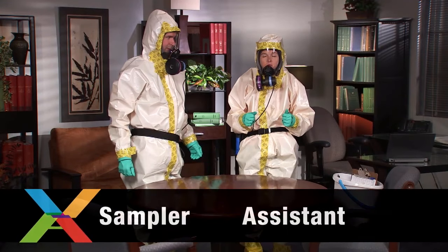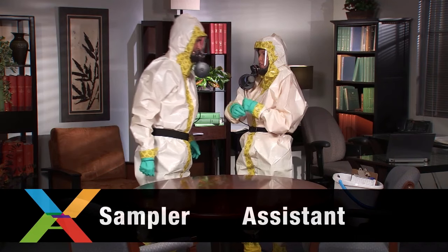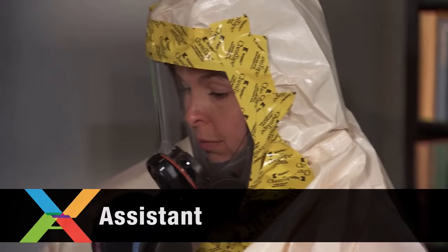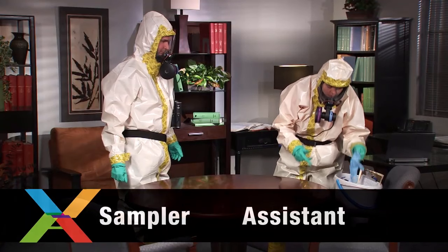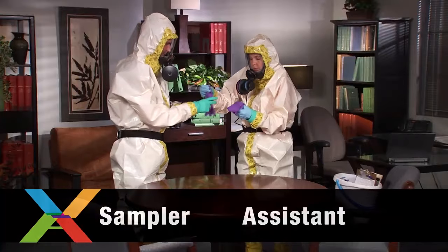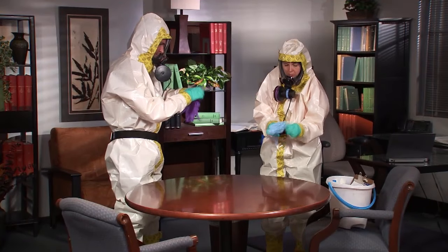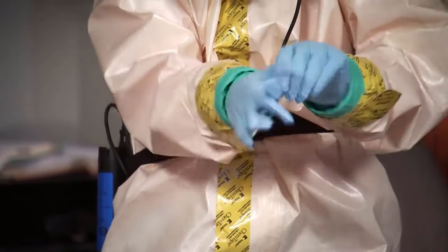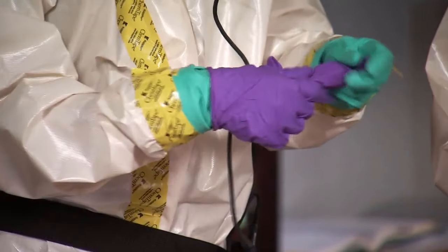Before you start, identify the sampler and the assistant. To minimize the potential for contamination, you should not change roles while collecting samples. The assistant will handle all the supplies, never touching contaminated surfaces. The sampler will only touch the supplies as the assistant hands them over. The sampler and the assistant start by putting on new, clean gloves. These gloves go on top of your normal personal protective equipment to prevent contamination of the sample.